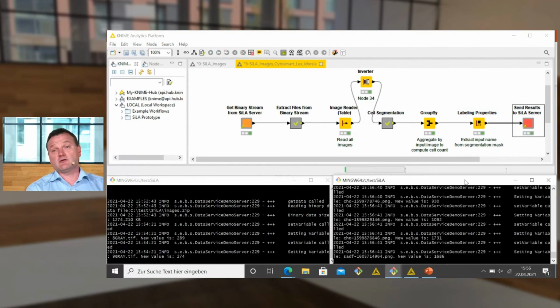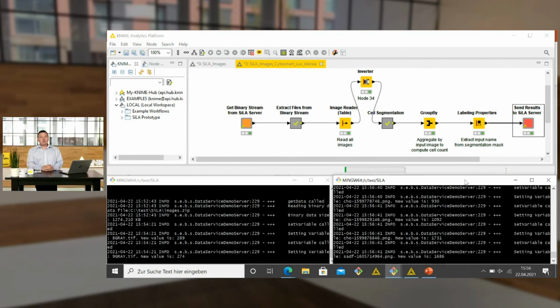And if you can connect them directly to a robot, you can say, well, do what is needed, bring them back to the incubator, or bring them up to the experiment. Finished now. That's all from my side.